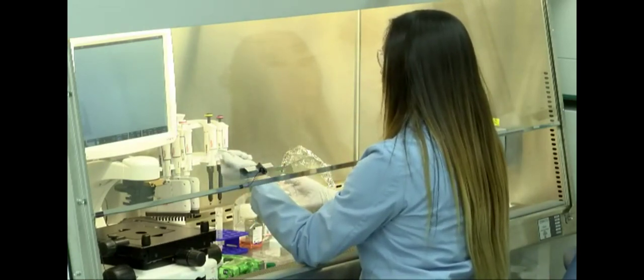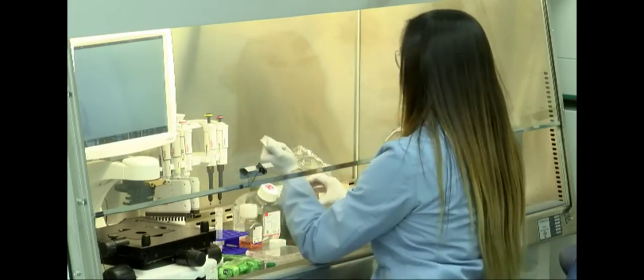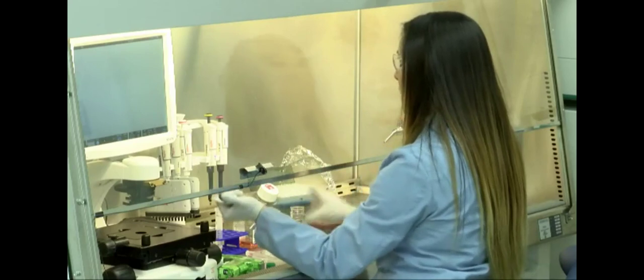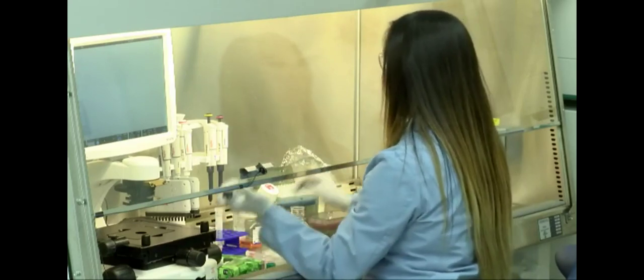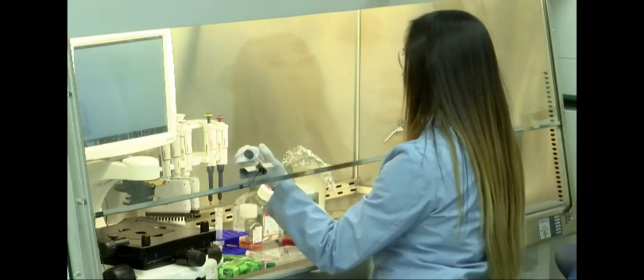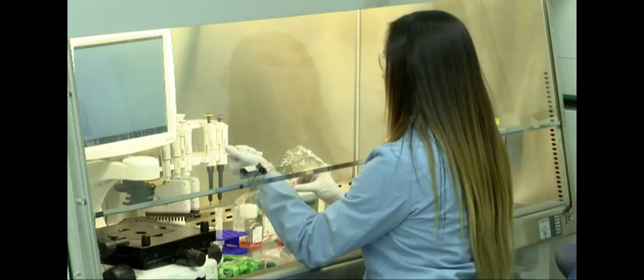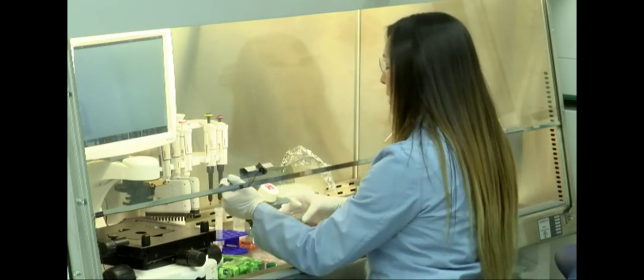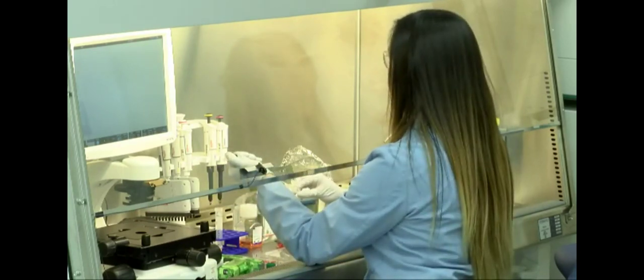So I've got 1 mil of our cells in our media, and then a typical amount of media for a 6 well is 2 mils. So I'm going to add another mil of our B27 classic media, and then now I can add my cell suspension. You never want to add cells directly to the well without media already in it, so that's why I already put some media in the well for you guys.